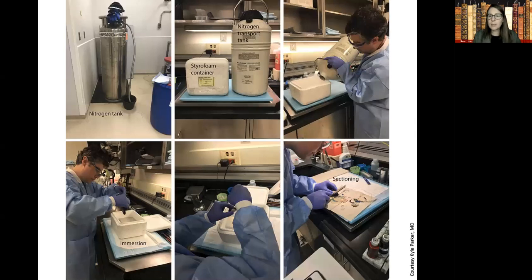So here's an example of one of our residents who loved this technique, showing what he does. So we take the liquid nitrogen from the nitrogen tank into the transport, end up pouring it at the table into the styrofoam container, in which then the small specimen is sort of immersed and then removed as soon as it's firmed up a little bit.